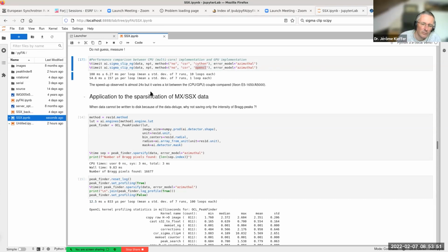I don't know why, but the reported performance on this GPU is really bad. This GPU is an AMD Vega 56, so 4 or 5 years old, but the performance in benchmarking mode is pretty bad, especially compared to what it can do when it's not in benchmarking mode.